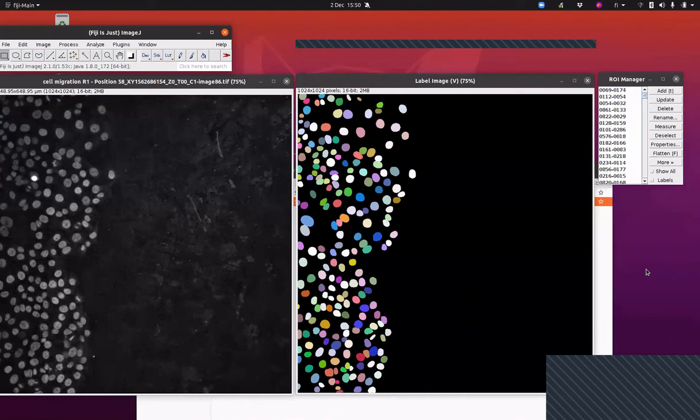Yeah, thanks. I've never had that before, so that's why I'm quite interested to find out what the issue is, and then I can run your model as well with the same StarDist version that I'm using here to see whether it's a model problem or a StarDist plugin problem. I see.